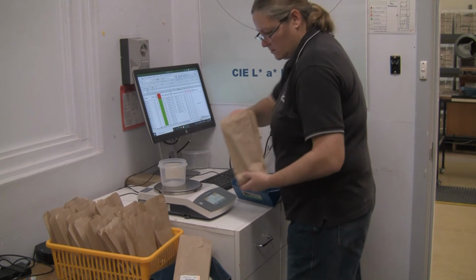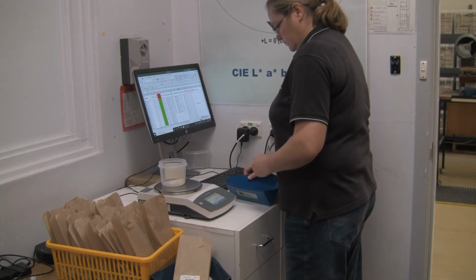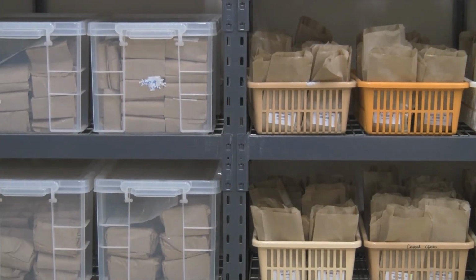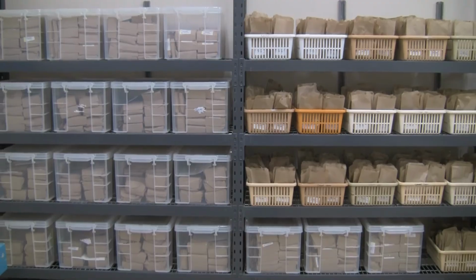The cereal chemistry team spends almost 3 months each year to determine the whole grain yield of Yanco rice breeding lines. It is a vital measurement in the Australian rice breeding program, and it is critical to the farmer, manufacturer and consumer to produce a high-quality variety suited to the Australian conditions and farming practices.